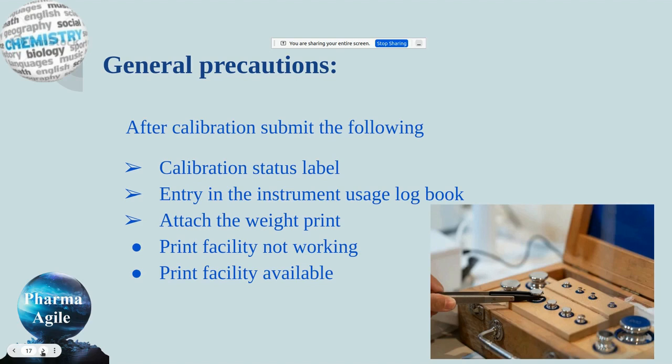The above mentioned general notes and precautions are applicable to all the analytical balances available in the quality control department.